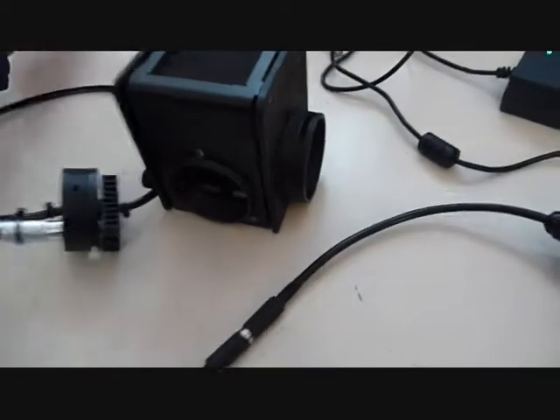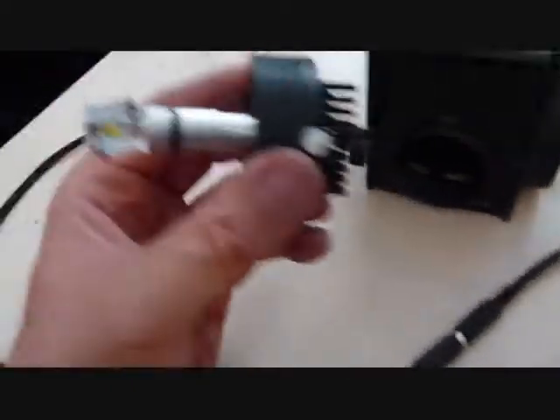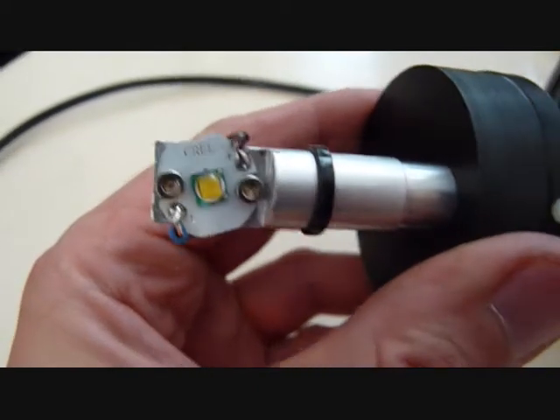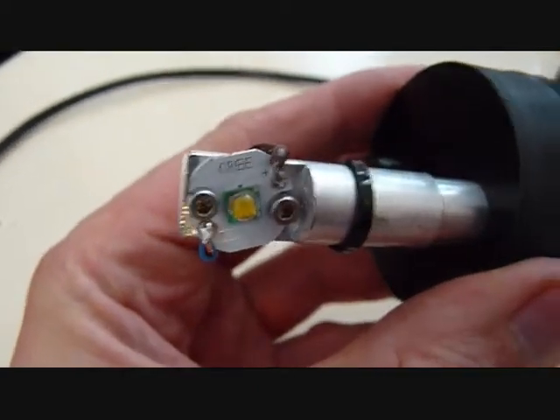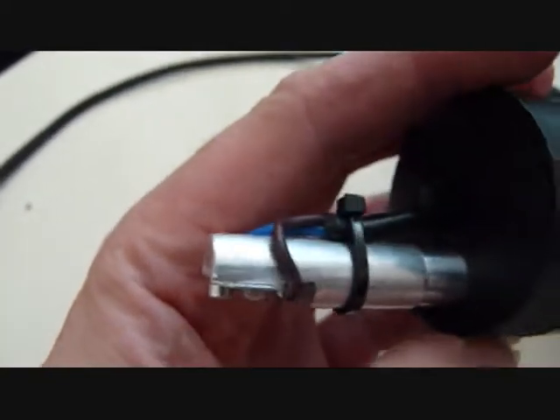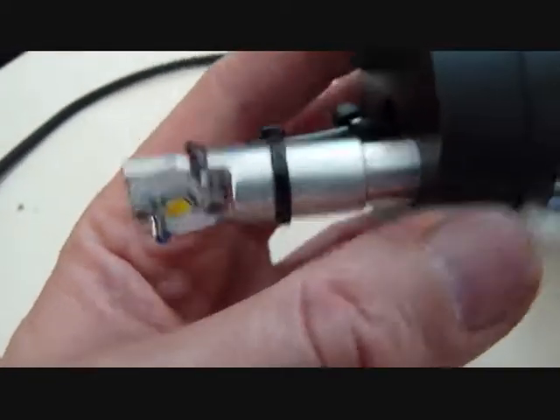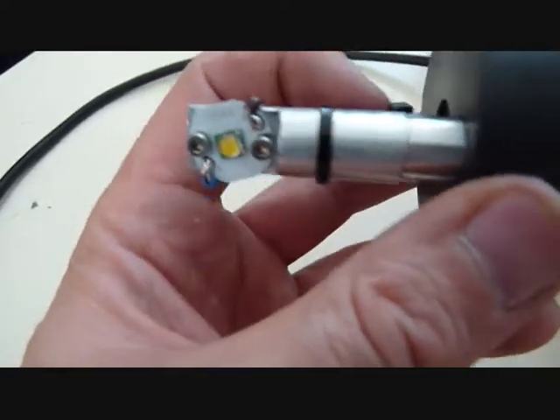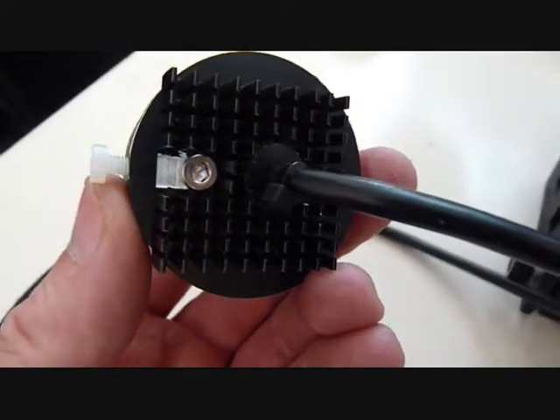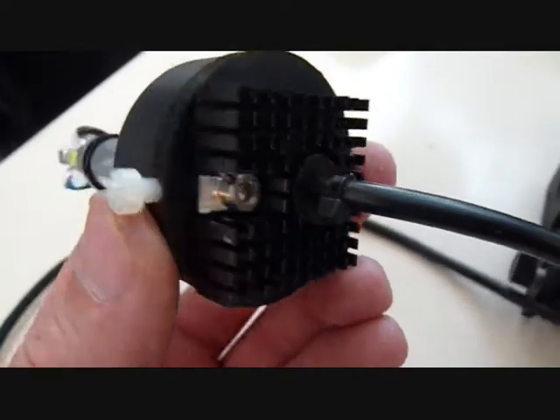So I made a new housing with an LED. Here we've got the Cree LED mounted on some aluminium alloy. It conducts the heat along the aluminium alloy. It's connected to a heat sink on the back.